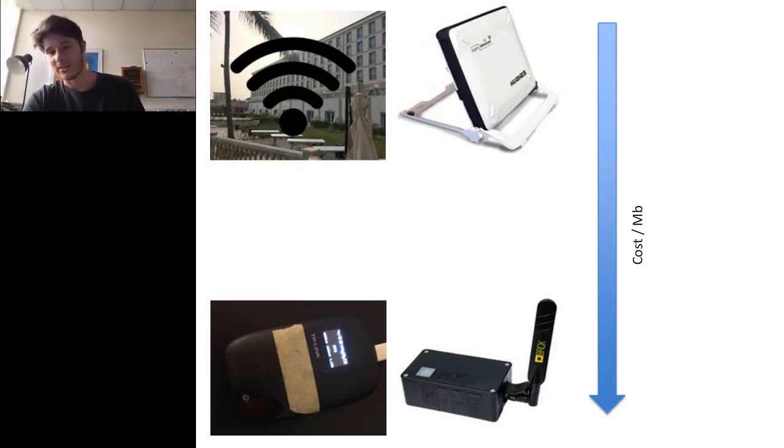And then we eventually settled on using just a typical 3G hotspot, like the ones shown here. This one was given to me by the World Health Organization, who organized the trip to Guinea. I actually went around, bought some SIM cards off people in the street and top-up cards, and tested the different speeds. We eventually found a network where we could get a fast enough upload speed to upload the data from one Ebola genome in a reasonable time frame of about an hour. So that was what we did going forward.